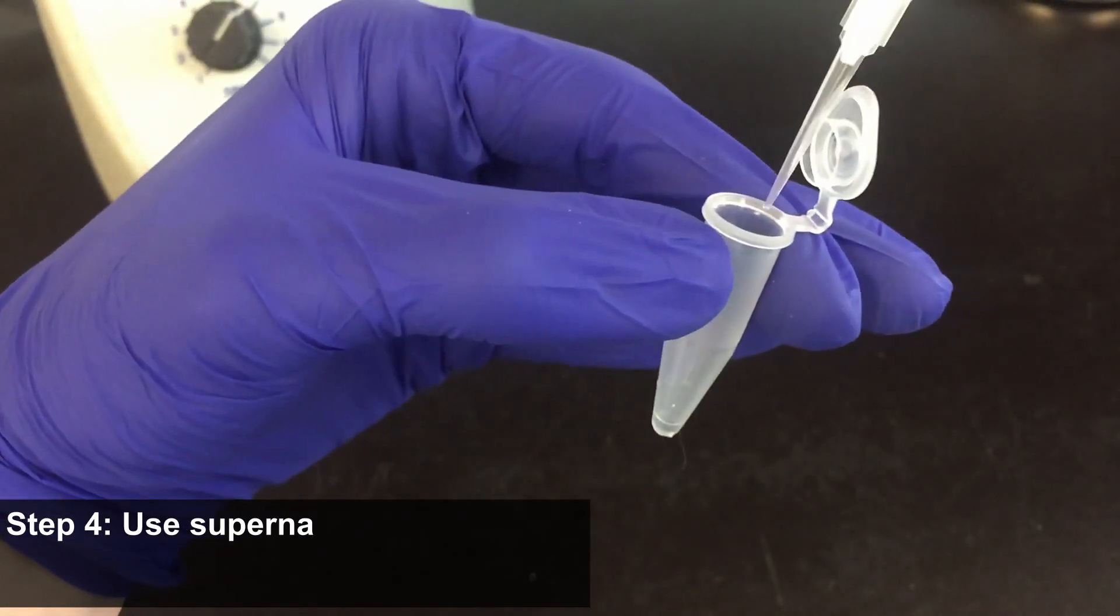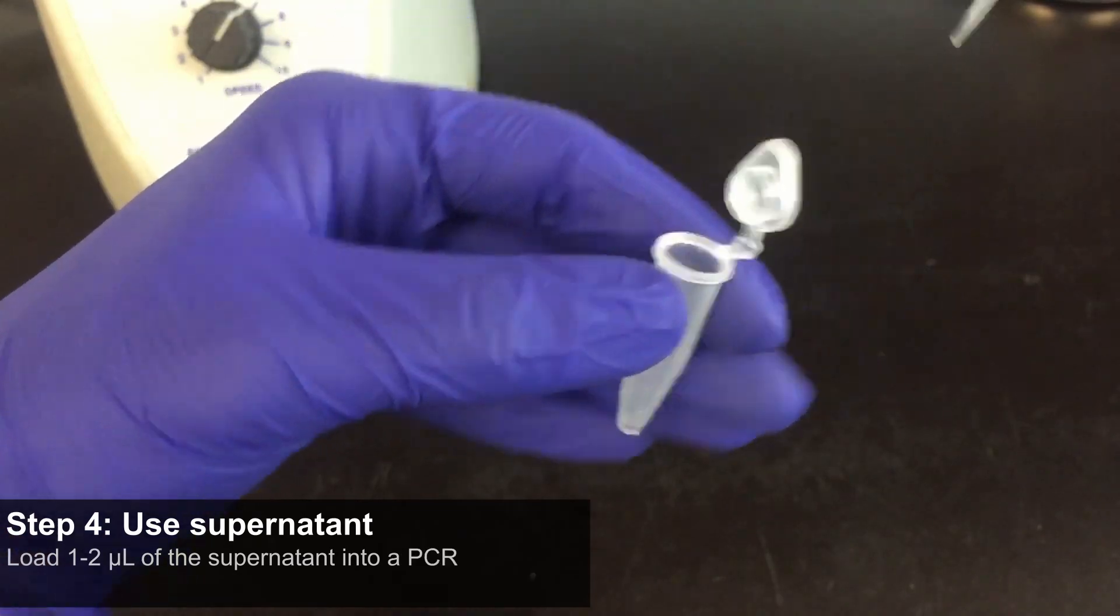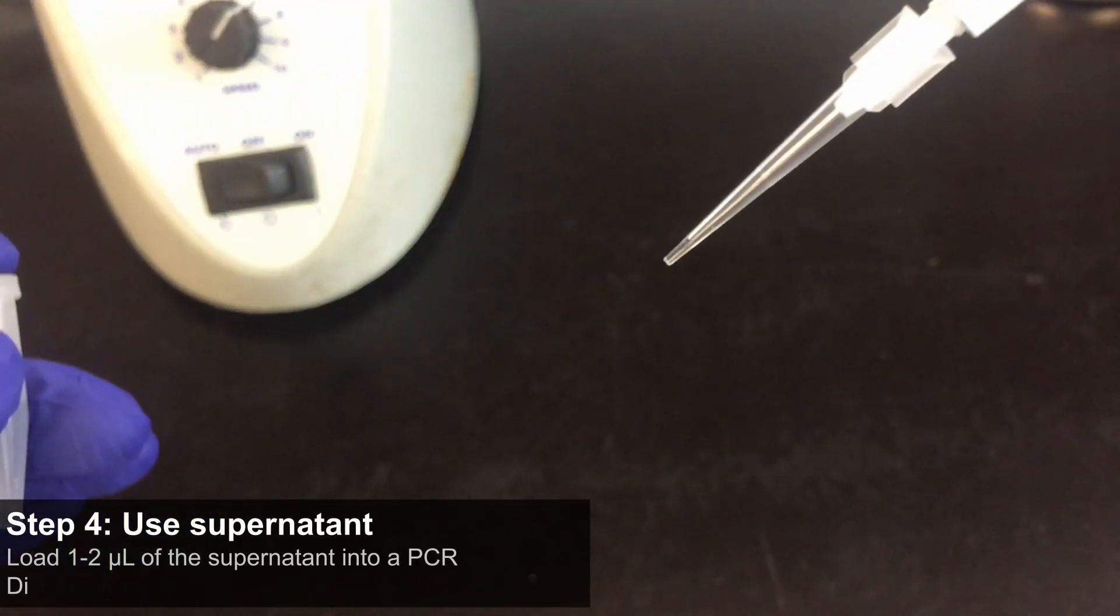Step 4: Use supernatant. Load 1 to 2 microliters of the supernatant into a polymerase chain reaction. Dilute or add fewer cells if PCR inhibition is observed.